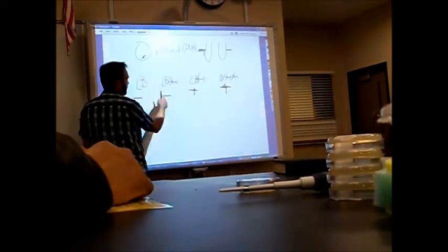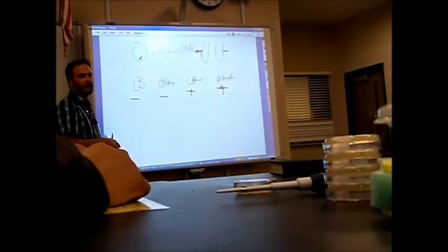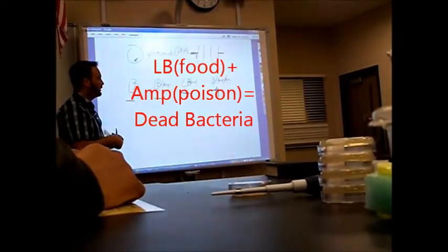How about the guys that didn't get the DNA that are growing on food plus poison? What's going to happen to them? They're going to die, you would expect. There shouldn't be any little colonies on here at all because they don't have the DNA that would tell them how to live in the ampicillin.